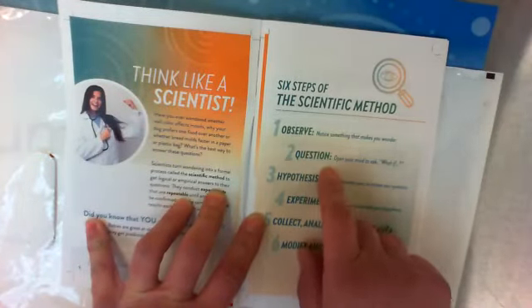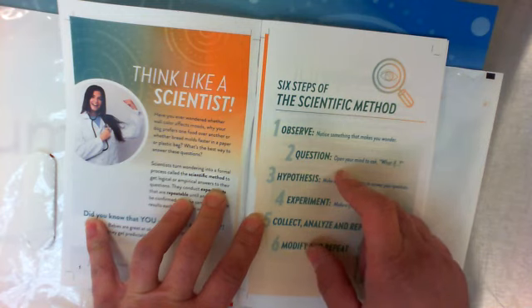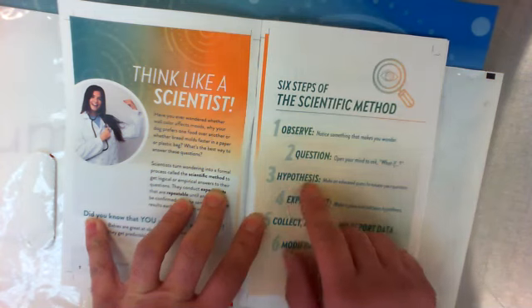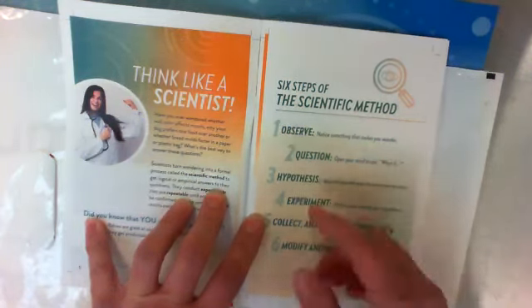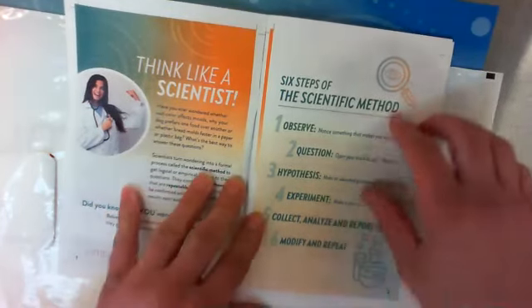You can do this with anatomy dissection. Observe the shark, question. So you see a shark, it's living, right? So it has to breathe. How does it get oxygen if it's in the water? I mean, we breathe oxygen from the air around us, but in the water, how does it get it? Make a theory. Does it breathe with lungs? Maybe you think it breathes with another type of organ. So there's your hypothesis.